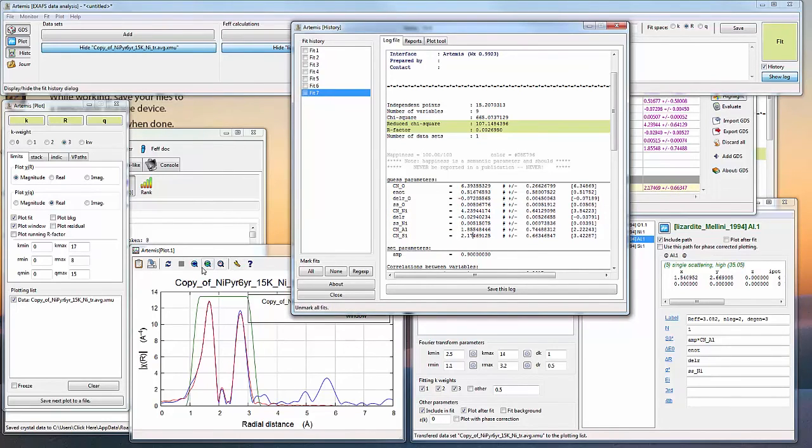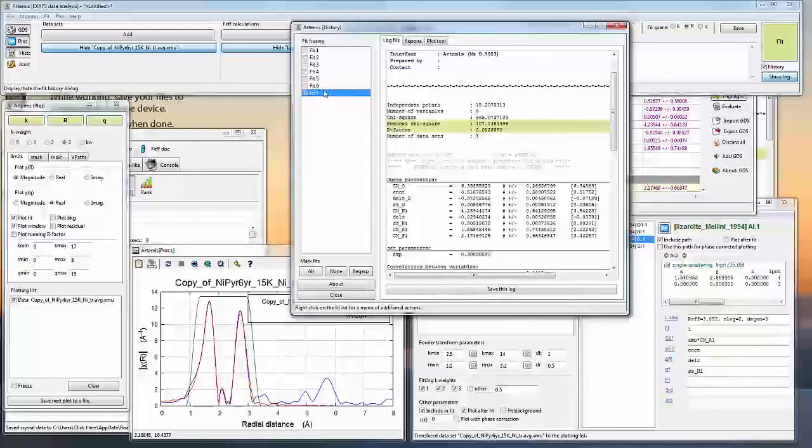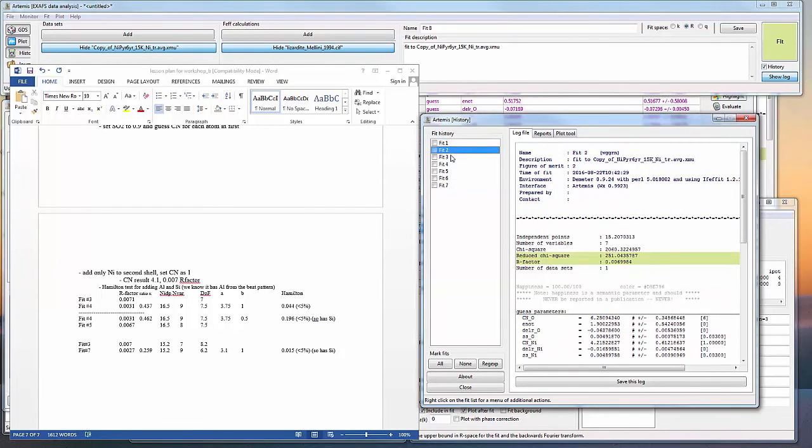It has everything that I want in it, because I think silicon would eventually, over 6 years, form as a tetrahedral layer on this sample. So what can I do to prove to myself that adding this aluminum and silicon really did improve the fit? Going through this series of 1, 2, 3, all the way down to 7 fits.